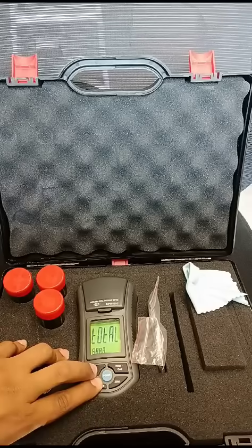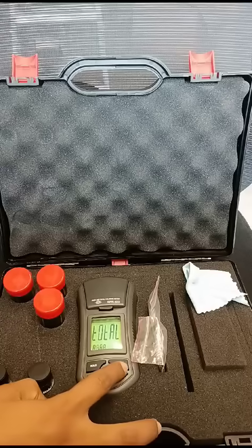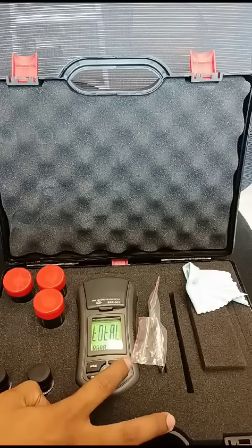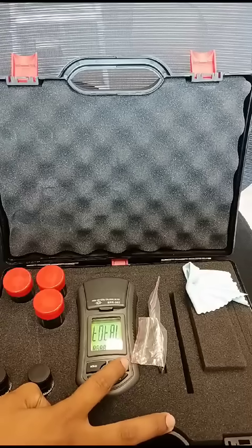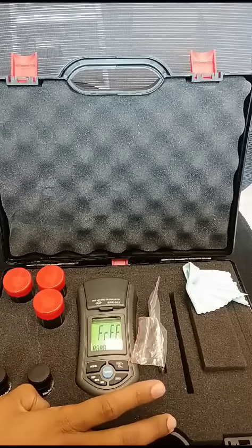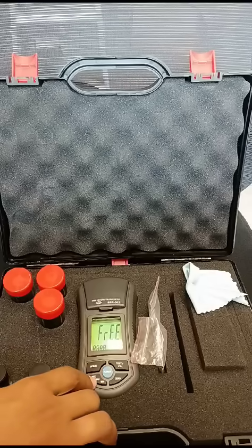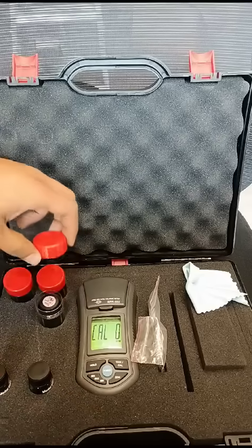Okay, then you can release the two buttons. To select between total or free chlorine — sorry — you should press on test. This is free and this is total. Today we want to check the free chlorine. To select, you should press on record.